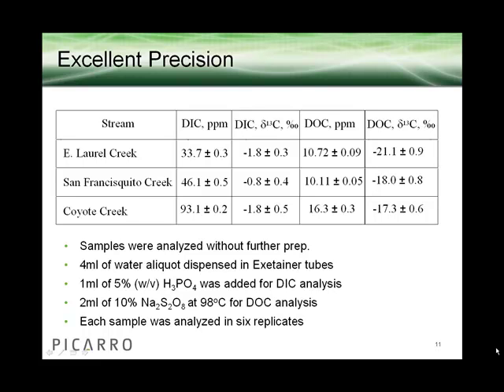As might be expected, the CO2 concentration liberated from both the inorganic and organic carbon was similar for the 2 western edge locations, and much different from the southern edge. Interestingly, the delta carbon-13 values vary very little for the 3 locations.